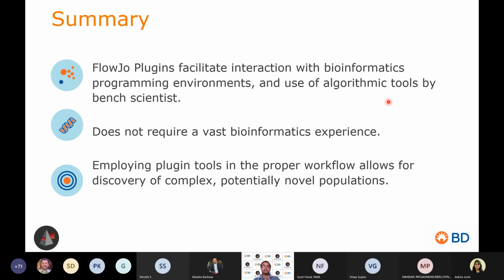Try using some simple data, it should not be 20-color data; 6-8 color parameter data is also fine when you're starting to practice and getting used to this informatics tool. It is really a matter of practice and getting used to these different plugins.